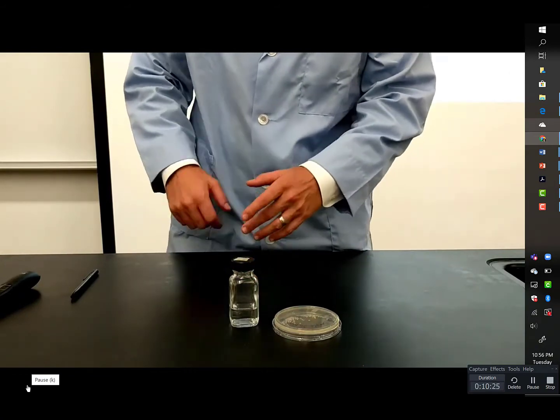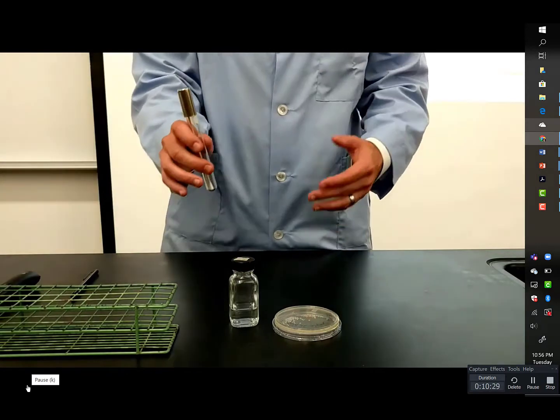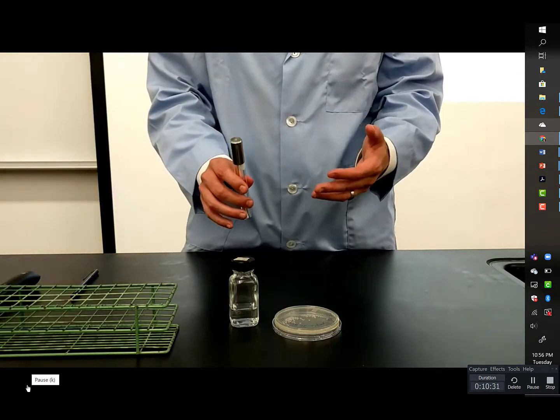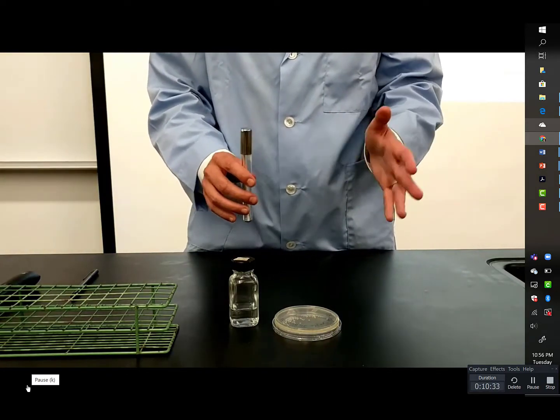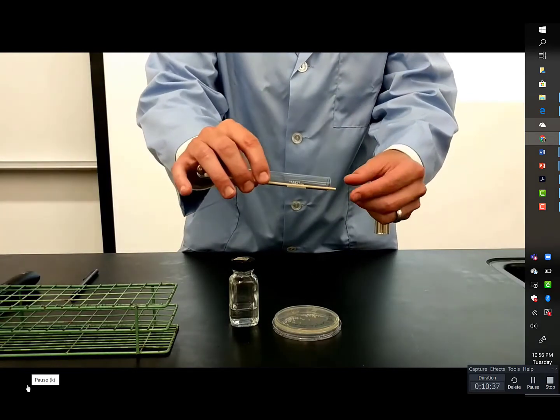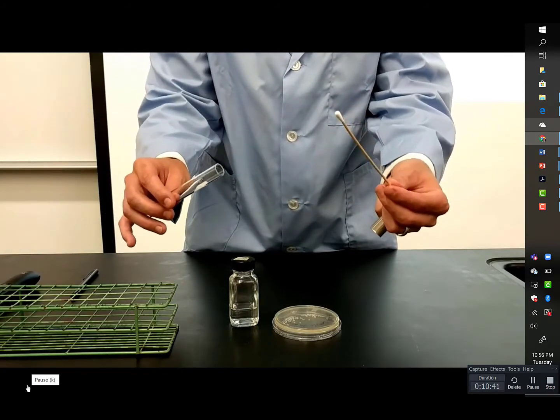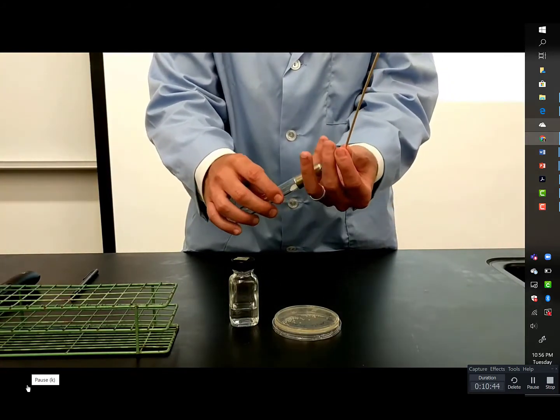We want to wet the swab because when we collect our sample, we want that sample to pick up nicely off of whatever it is that we collect. So here I'm getting a sterile swab. Now when I take this out, I want to do a careful job to not touch the sterile swab to something that's not part of my experiment.